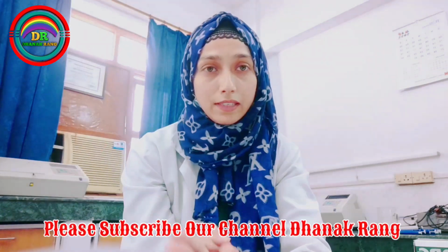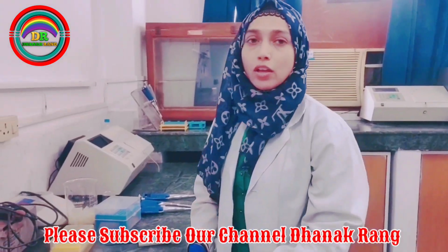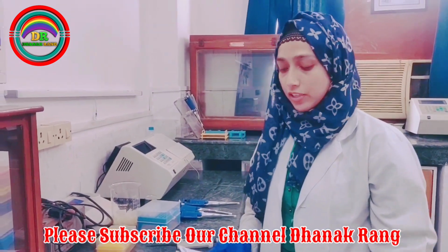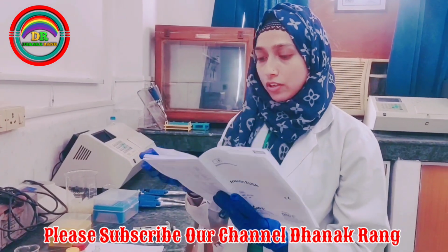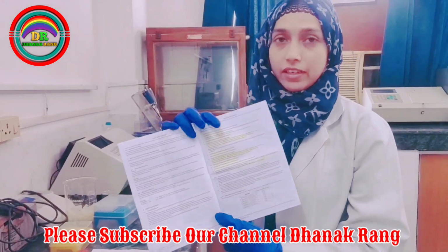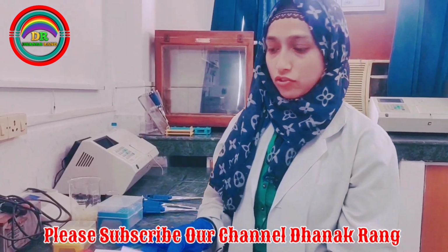So before proceeding with the test, first we have to standardize our kit using these standards. Then we can proceed with the test procedure. So now we will start performing the standardization. This is the guide which we have got along with the kit, and this is the protocol written here, the test procedure. So we will follow this procedure to perform the standardization.